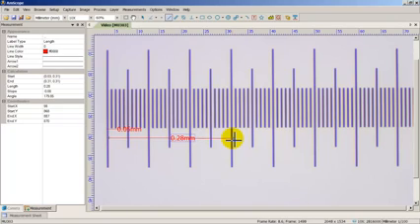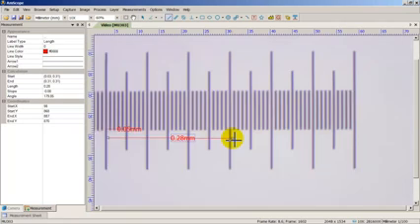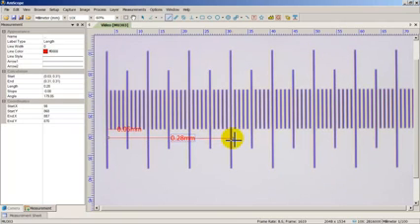So this is how you do the measurements and calibration on the microscope. Again, for each and every individual objective, you're going to have to go ahead and calibrate for that. So just follow these steps, and you should be fine on calibrating for the MU camera series.